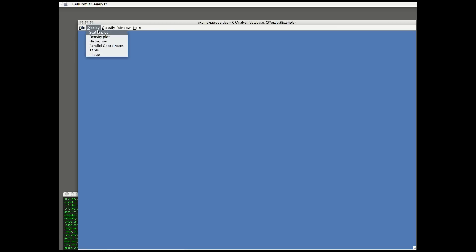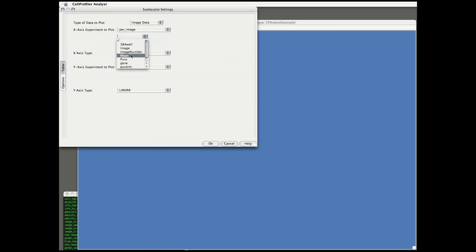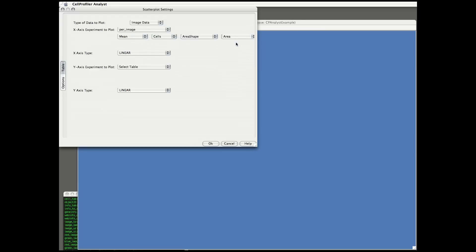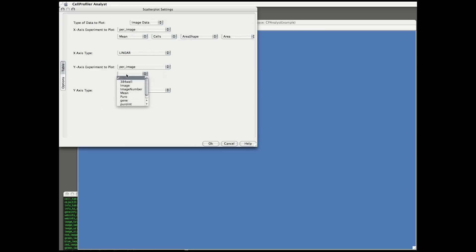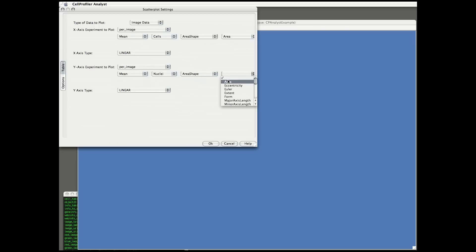I'm going to start by displaying a scatter plot, choosing two features that have been measured in the images: mean cell area versus mean nuclear area. So all the individual cell measurements have been combined into a mean for each image. In this data plot, each point is going to be representing a single image.